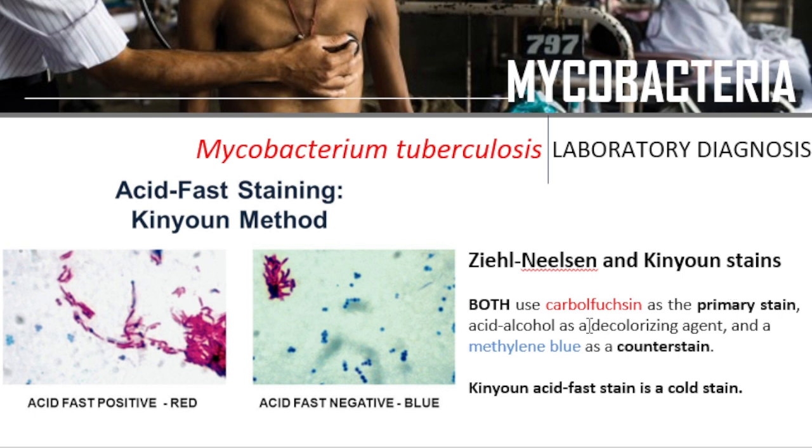After that, you apply acid alcohol, which serves as the decolorizing agent, and then followed by methylene blue, which is a counterstain.